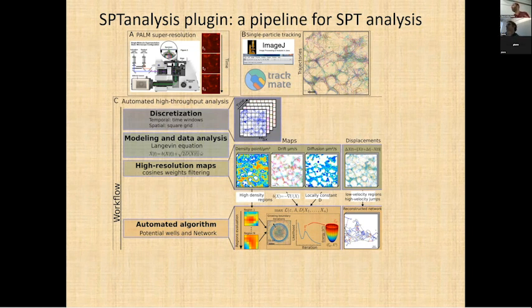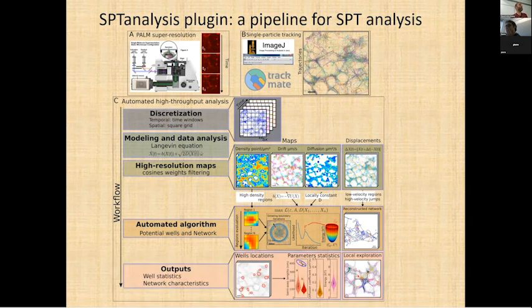find a boundary, which is the hardest part, where you have to decide where to position this abstract boundary. So there are algorithms based on a minimization procedure, and you can also use this to reconstruct nodes or regions of density in a graph. And then the output gives you the possibility to extract CSV files, where you can get all your statistics of interest, the parameters such as the dimensions of the ellipses associated to this structure, the energy, mean time, and so on. Okay, so this is what the pipeline is doing.